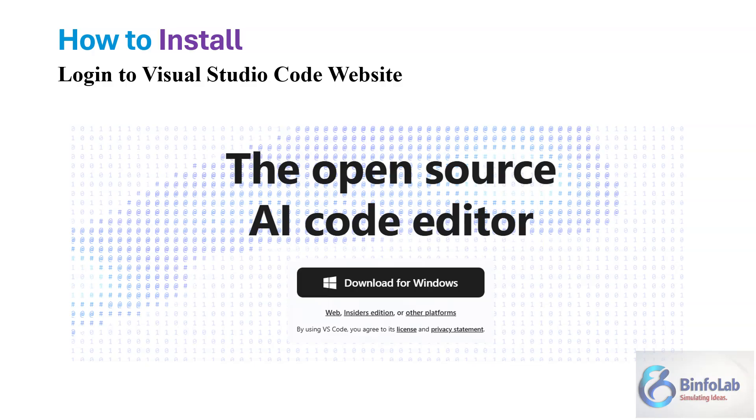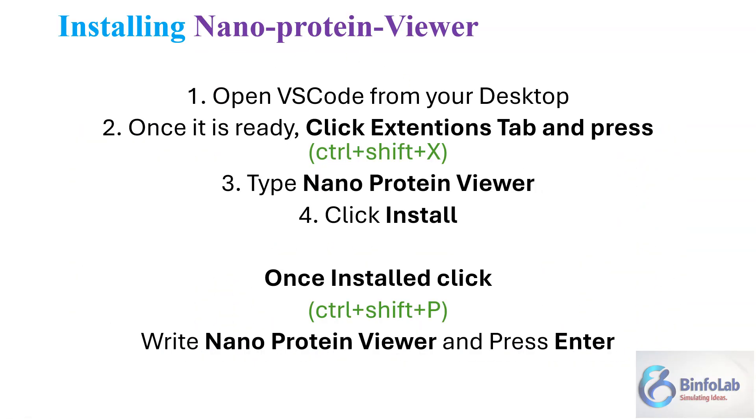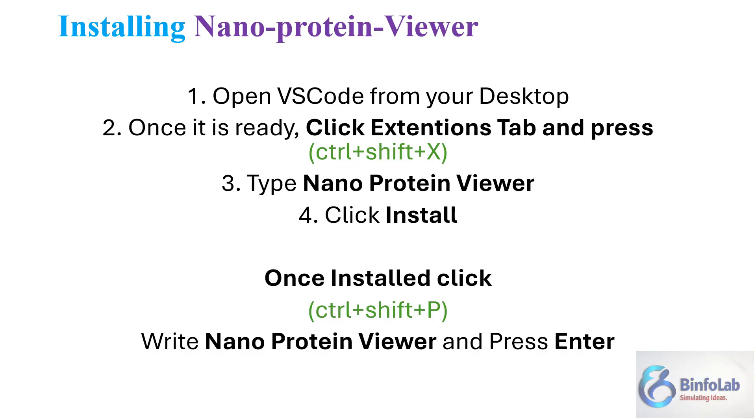On the website you will see at the top this kind of message. If you are using Windows, just click here download for Windows. If you are using some other platform like Linux or Mac, there are other platforms. You can install it easily from here.